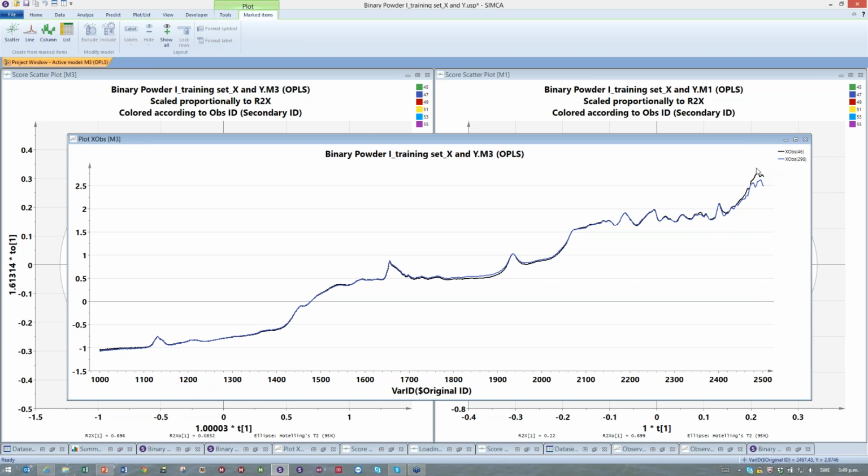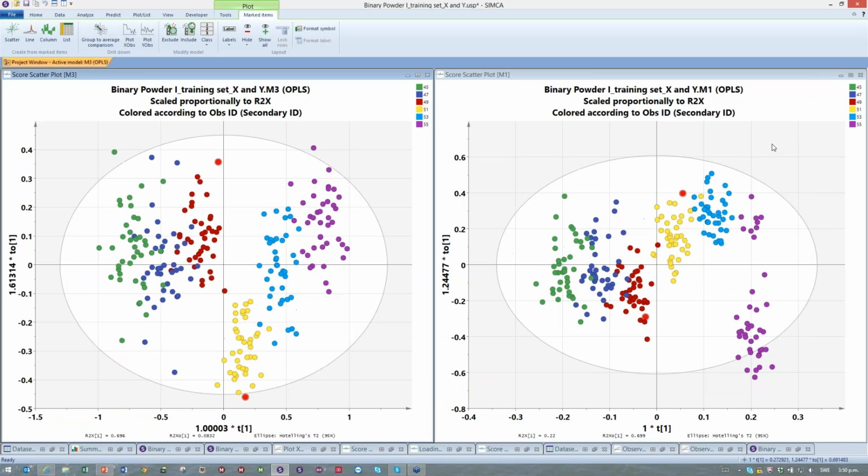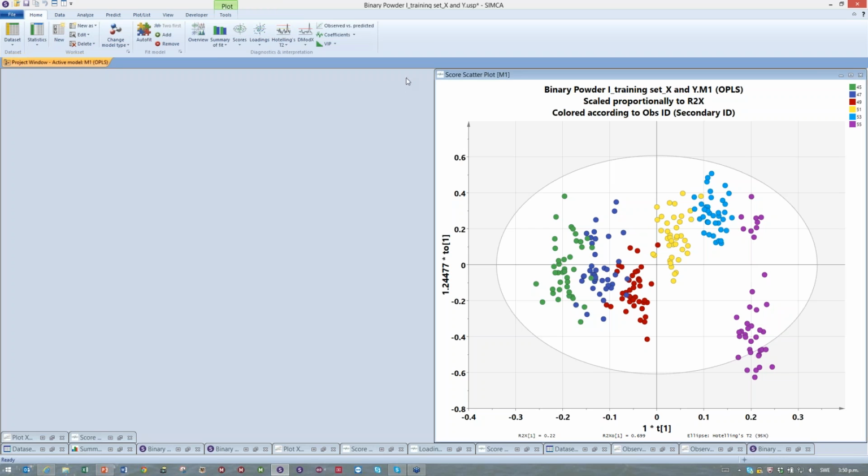And part of this split here was one of the contributing factors leading the researchers to decrease the spectral window in the stage 2 binary powder application, where they had fewer variables, which was a result of narrowing down the spectral window and also using a modified resolution. Apart from this, we have very similar statistics for the initial model and the model based on the preprocessed data. So the preliminary conclusion would be that the spectral preprocessing using SNV was a good thing to do.